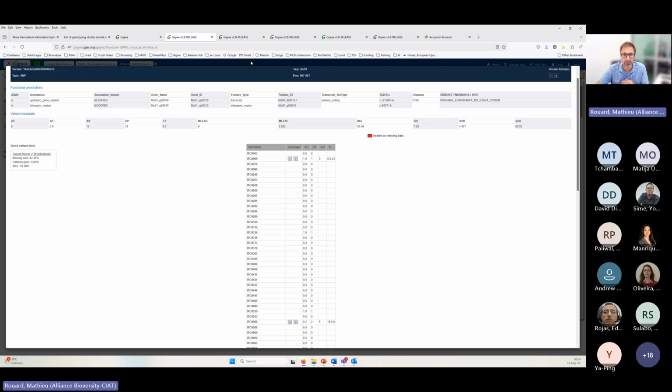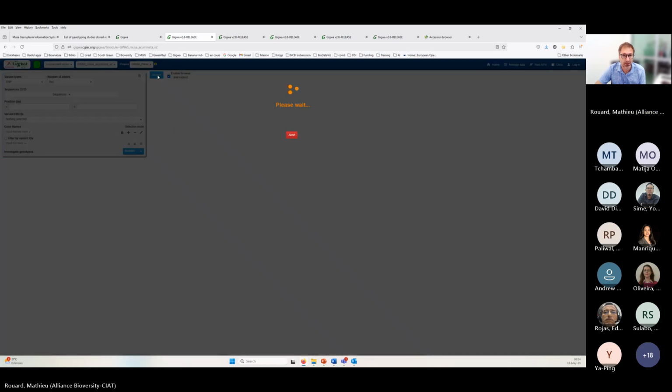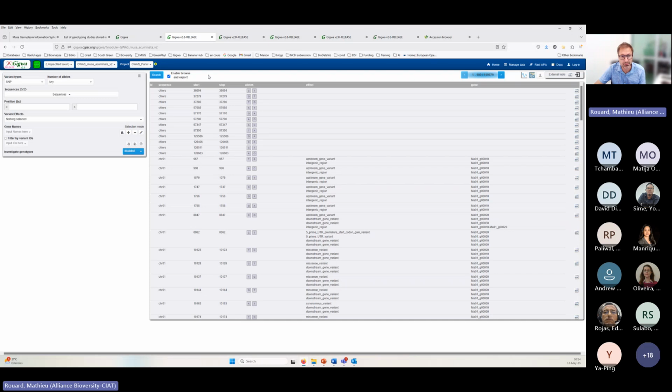So basically, you have a huge matrix of GenBank accessions with markers. It can be 1,000 by a million markers. This is what the system is able to store and display. The added value of the system is that you can really query the information. This big file that is now in the database can be queried quite fast by a number of fields to filter. So you can select, I want only the SNP, and you are going to have only the SNP in your dataset.